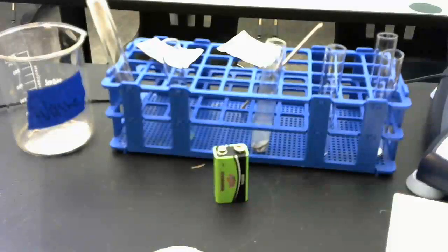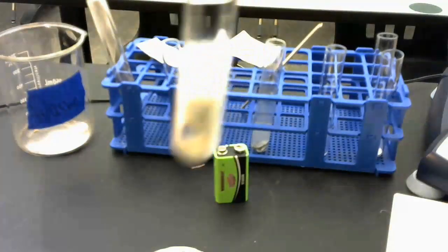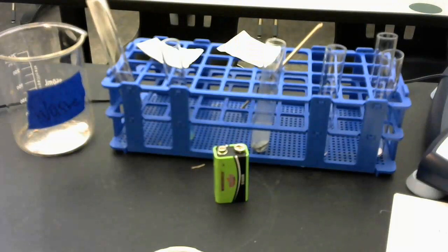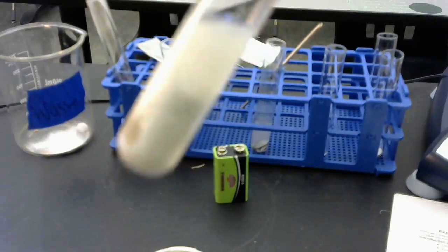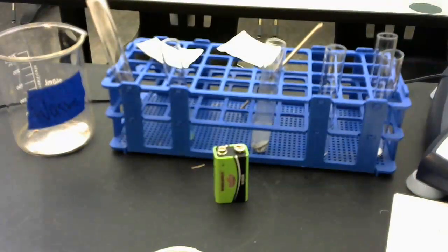So I had two aqueous solutions. Aqueous means dissolved in water, and it produced a solid in the end. That solid produced by two aqueous solutions is called a precipitate. A precipitate is what's formed when two aqueous solutions react with each other to produce a solid, and the solid is the precipitate. And that's pretty crazy. So let's think about that. And it kind of looks like a cooked egg white almost, is how I would explain that. So I have AgNO3 reacts with CaCl2.